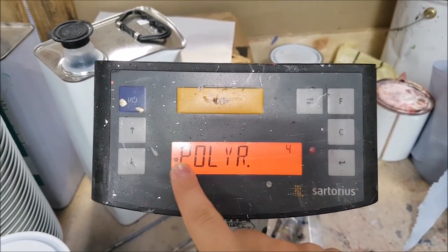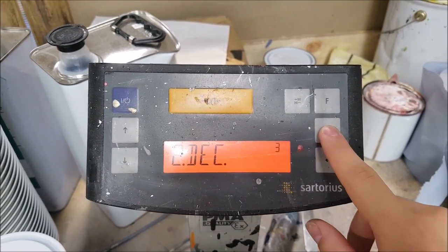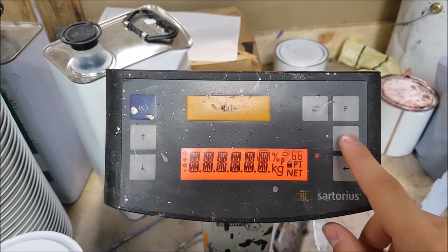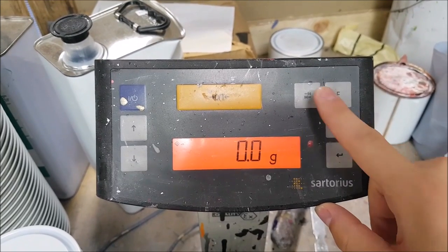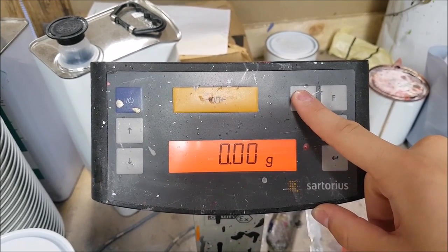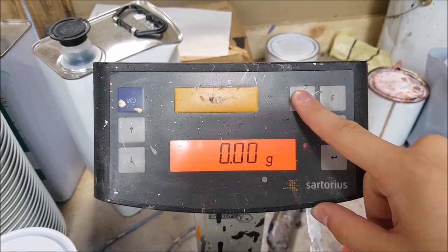When you've selected polyrange, click return to go back to the main menu. When you click the toggle, this will then change it from 0.0 to 0.00 quickly.